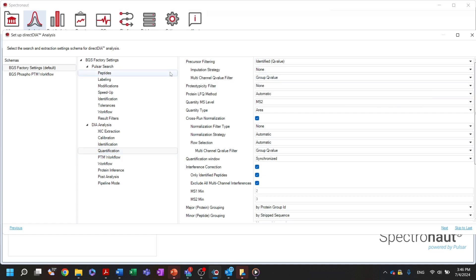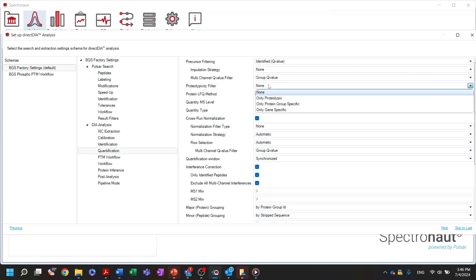Secondly, you can select which peptides will be used for the quantification of protein groups based on the protein specificity. For example, you can select only prototypic peptides. By default, this is toggled off, meaning that any peptide associated with a given protein group might be used for its quantification.